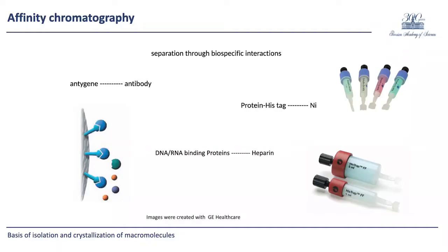If the target protein does not bind at a high salt concentration, a more hydrophobic resin should be used. If the target protein binds to the resin so strongly that nonpolar additives are needed to elute it from the resin, it is necessary to lower the salt concentration in the starting buffer or use a less hydrophobic resin. So using the difference in hydrophobicity of a target protein and other cellular proteins, we can purify one from others. The next type of chromatography is affinity chromatography.